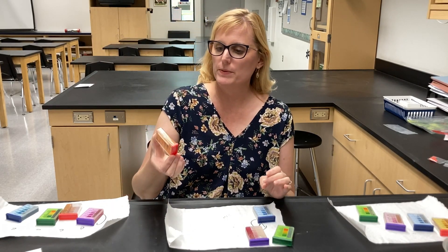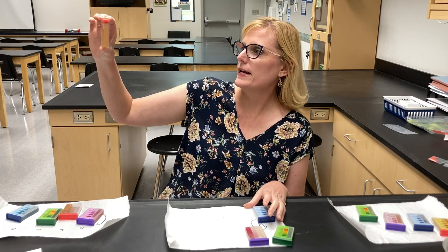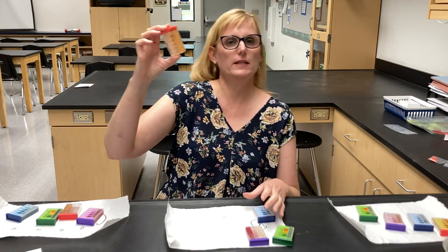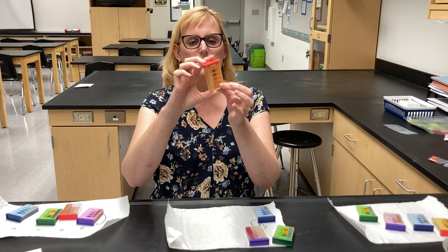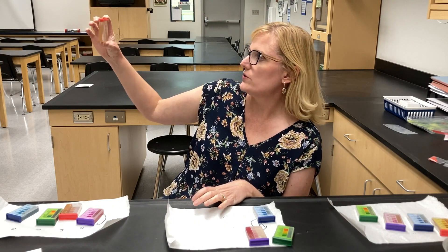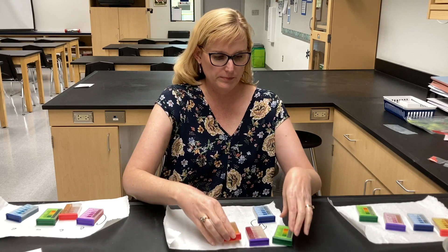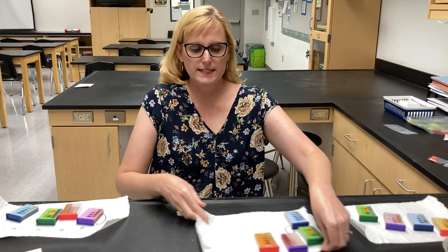And then our potassium is low. When I hold it up to the light I see it is depleted — it's just a little bit yellow, but our water was yellow too, and there's very little color change, so it is depleted for potassium. So that is sample B.